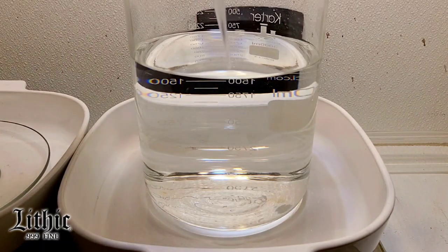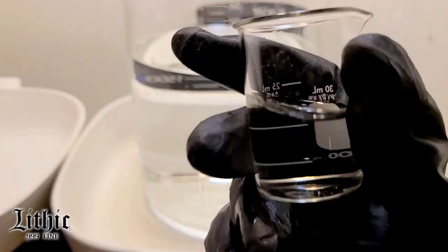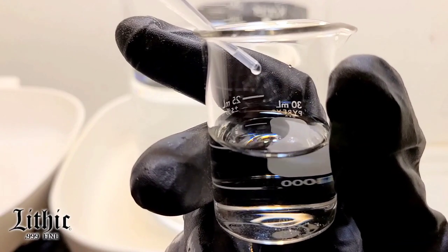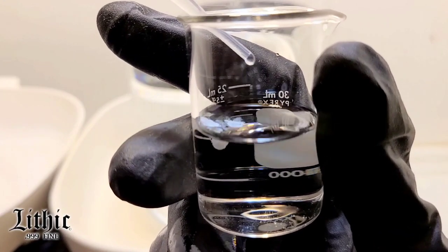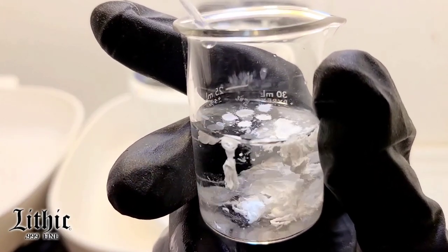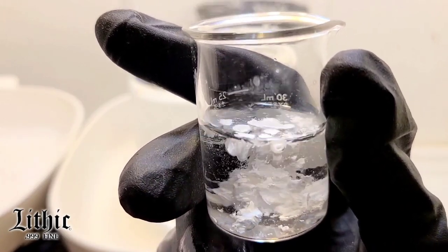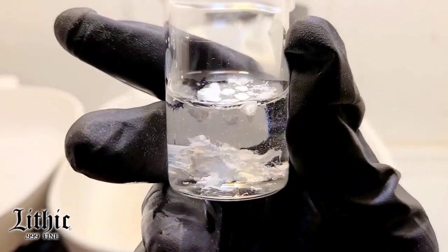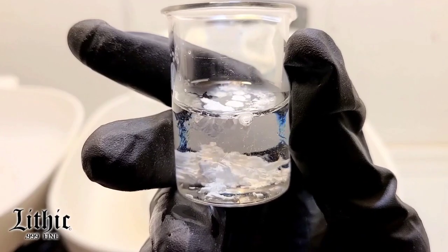Let's do a quick test here. I've got some HCl. I'll add a bit of solution and immediately we see a reaction — silver chloride is coming out of solution. So we can definitely rest assured that our silver is in solution. I'm going to get that aside because I don't want that stuff anywhere near my real batch.